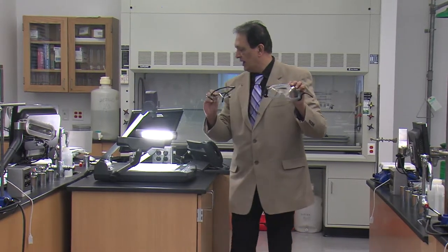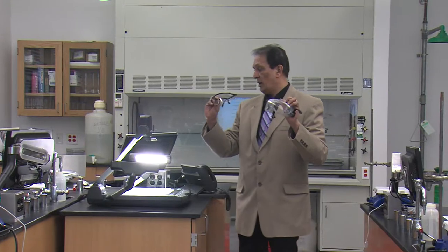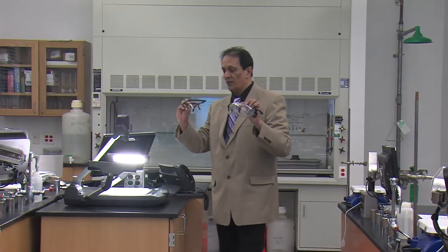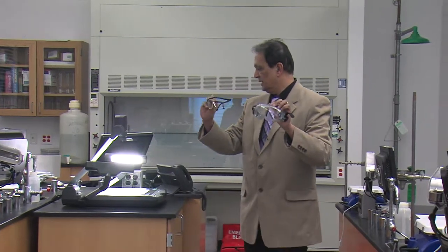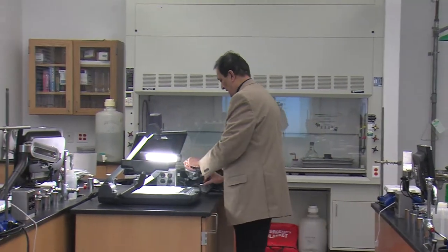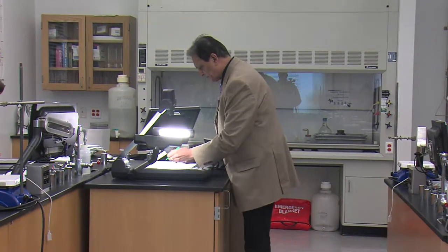One strike and you're out. These should be over your eyes at all times. I will not come and ask you why you're not wearing your safety goggles. I'll just ask you to leave and you get a 0 for your experiment for that particular day. All right, that's number six, eye protection.